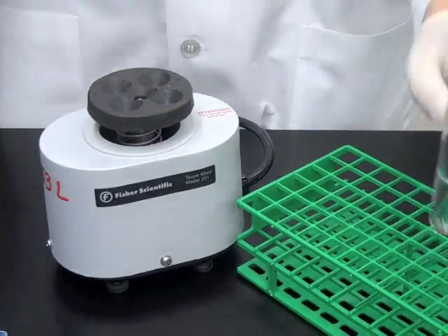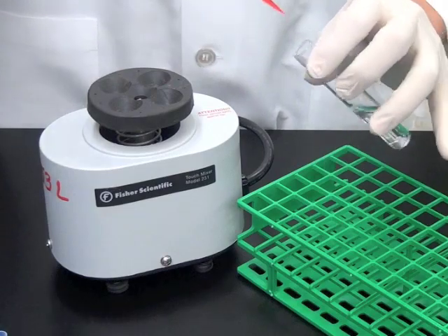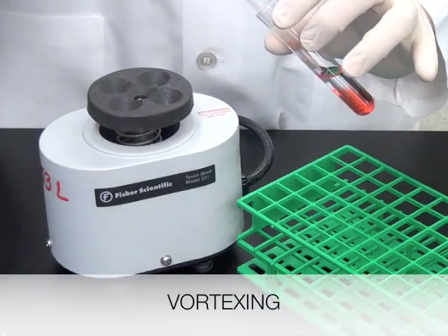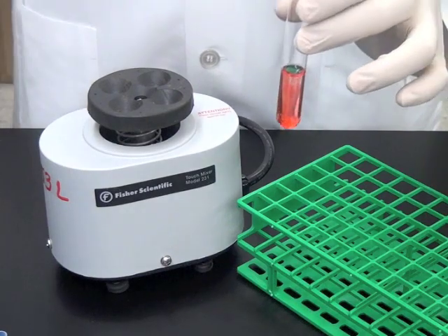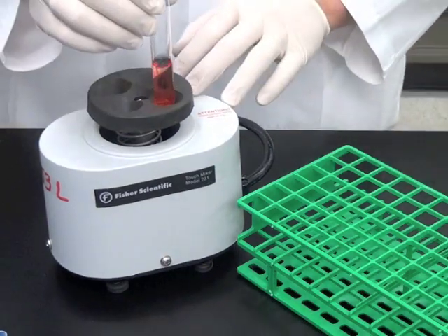There are four ways to mix the solution. The default method is vortexing. To vortex, touch the tube on the vortexer and allow a vortex to be created throughout the entire solution.